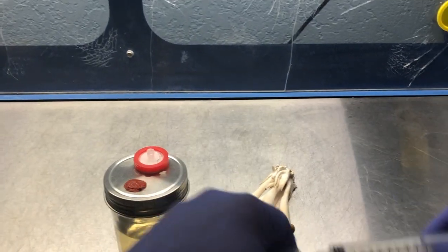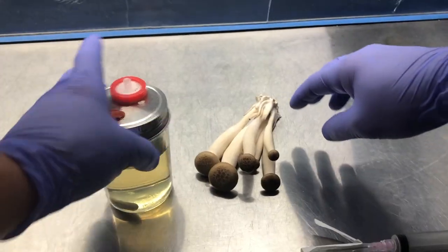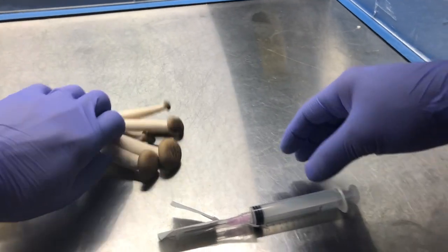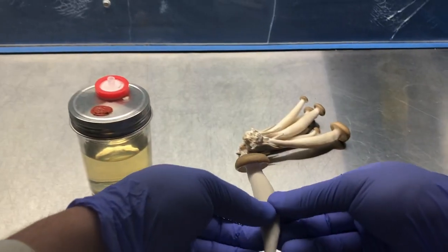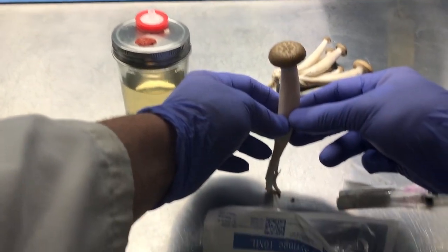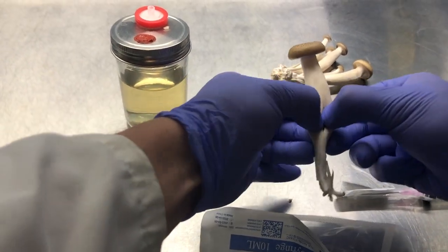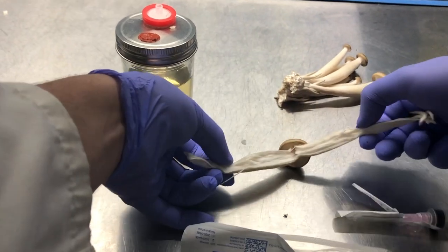So I'm going to get my needle ready. Ideally, you want to use a larger gauge needle, but this is all I have right now. I've never tried this before, but I'm going to go for this really big beach mushroom here. I really like the cap on that. These are, you know, really firm. They almost got like a crunch to them. So the trick is just to get to some sterile tissue.